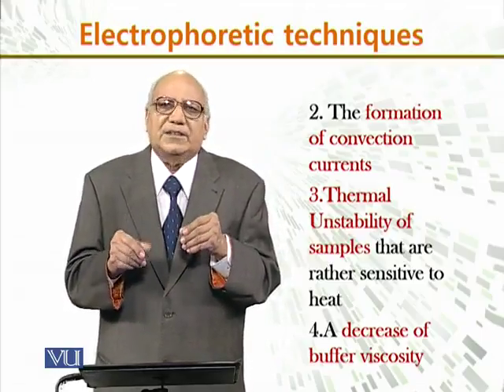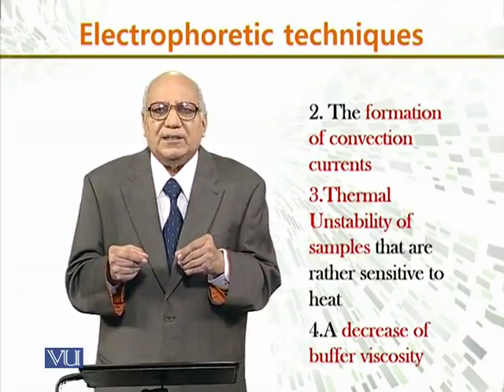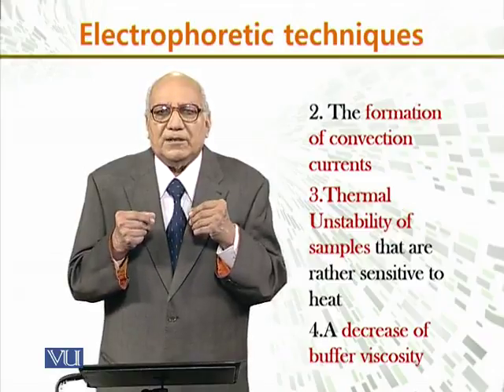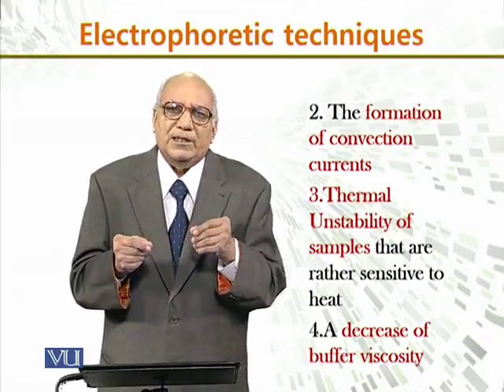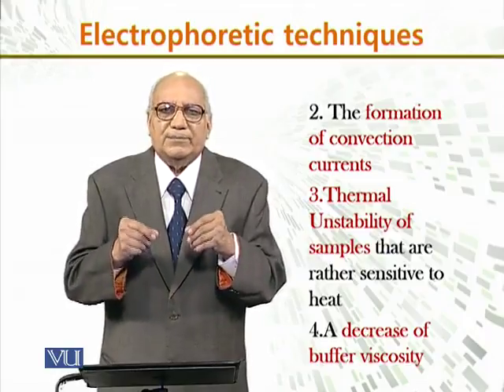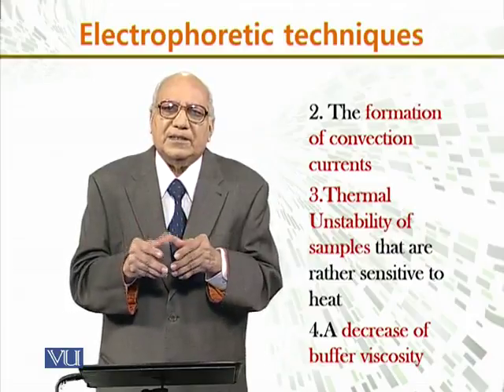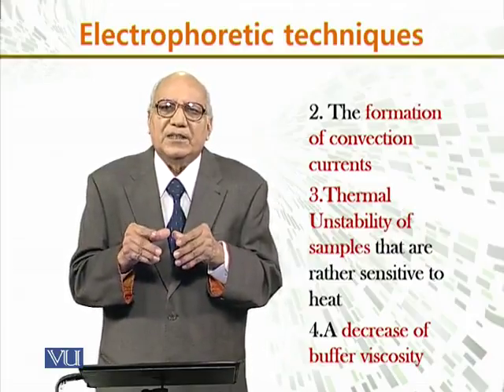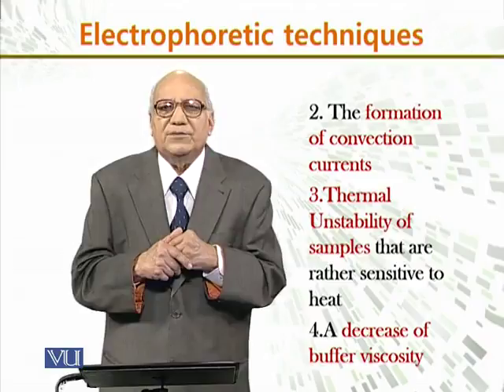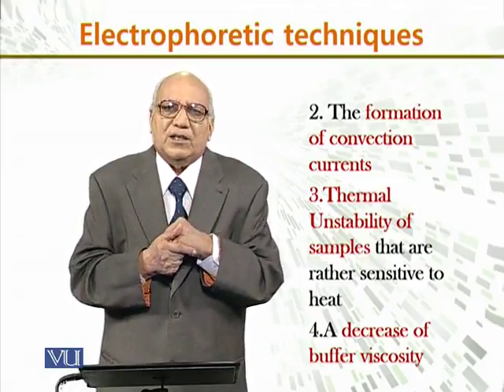But in certain cases, the heating helps as well, and the separation of molecules can be performed better, allowing good analysis of the different proteins present according to their charges.